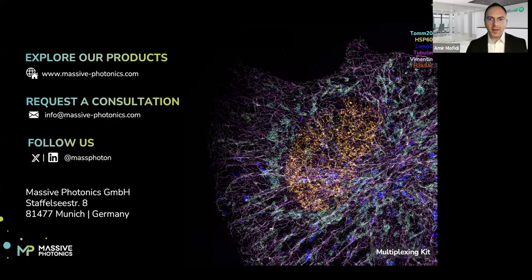That's great, thank you. And one more question here. How reliable is DNA-PAINT for counting molecules?